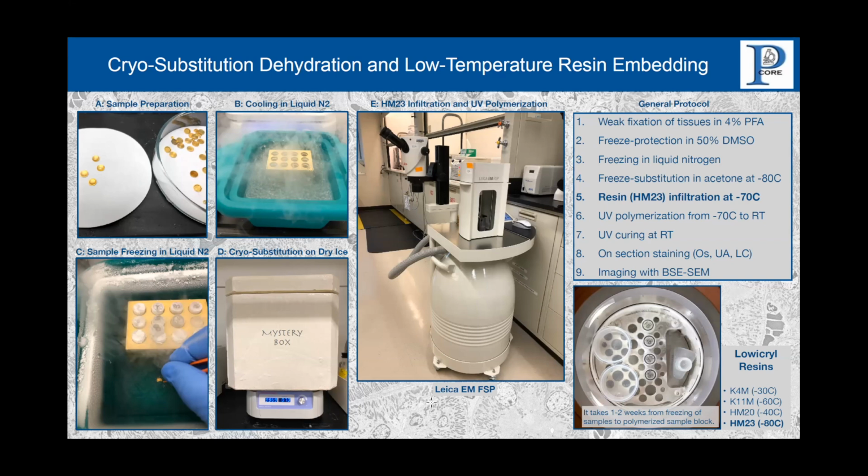So the high pressure freezer can still provide some benefit, but not as much. Secondly, instead of high pressure freezing, we freeze protect our samples and then use freeze substitution. The advantage is that after freeze protection, you can process thicker samples, which makes it easier to create wide field sections of these samples.